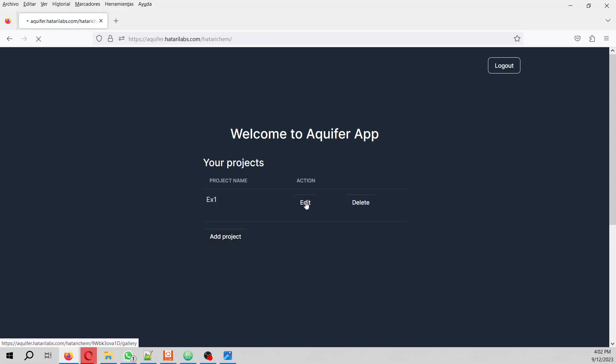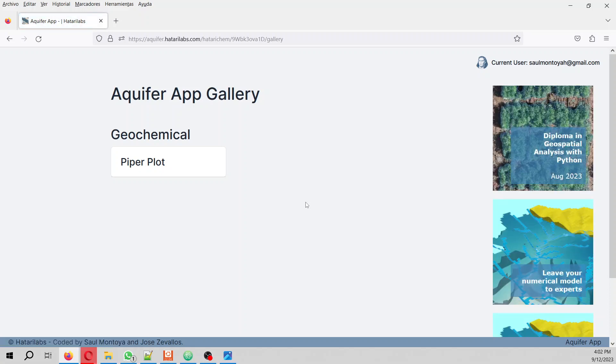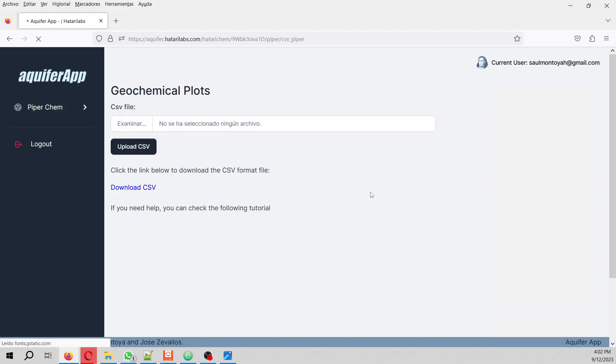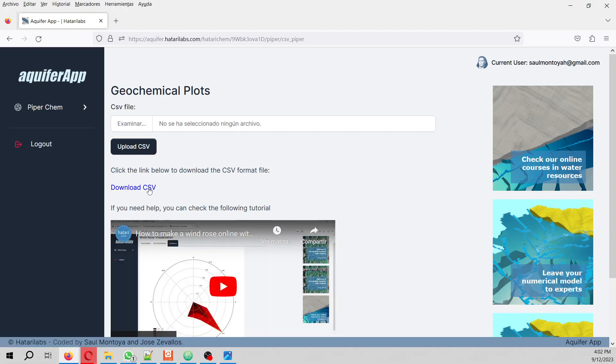Aquifer App does not only make Piper plots - it will do a lot of stuff including Stiff plots and Schoeller plots. But in this case we are going to do a Piper plot. The process is really easy.